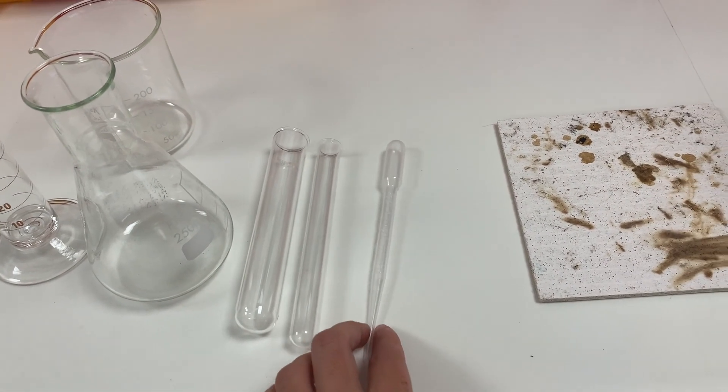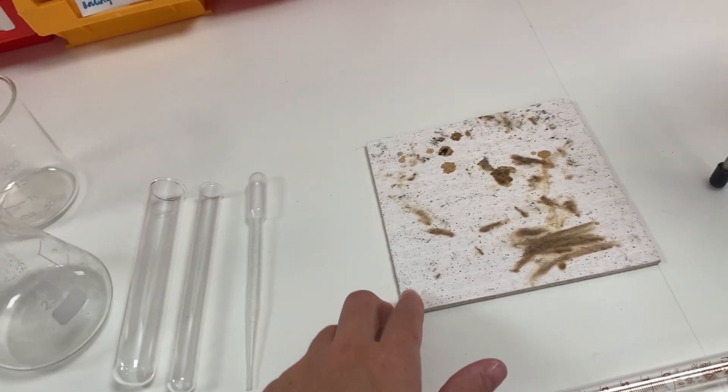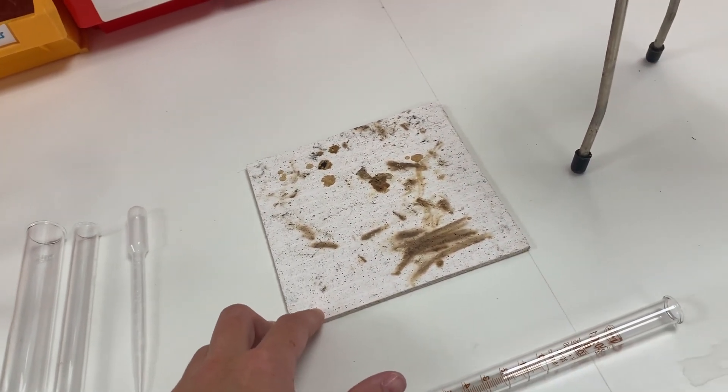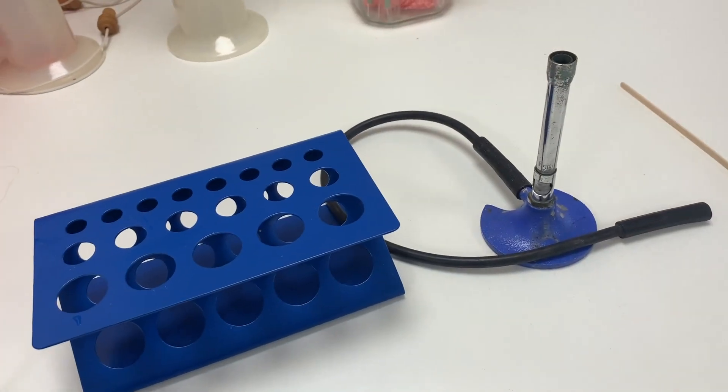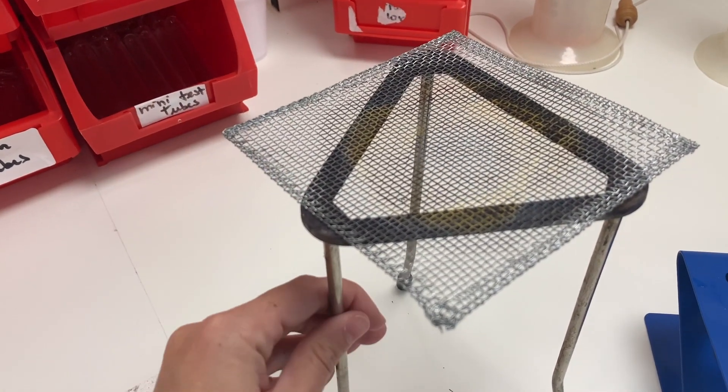Then we've got a plastic pipette here used for transferring liquids. The heatproof mat is a necessity whenever you're burning anything using a Bunsen burner, and you'll often find that you have to set it up so that you place a tripod on top of the heatproof mat together with a gauze.